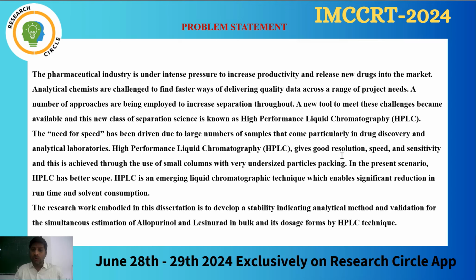HPLC gives good resolution, which means the separation between two components, as well as speed and sensitivity, and this is achieved through the use of small columns. In HPLC we use a stationary phase and a mobile phase. The stationary phase is called the column. It is made of stainless steel material which is packed with packing material like silica, alumina and so on.